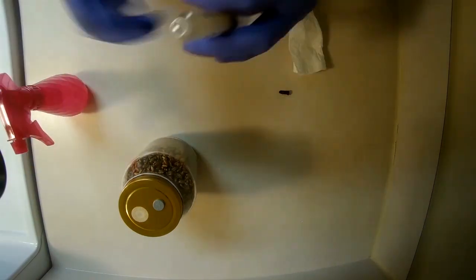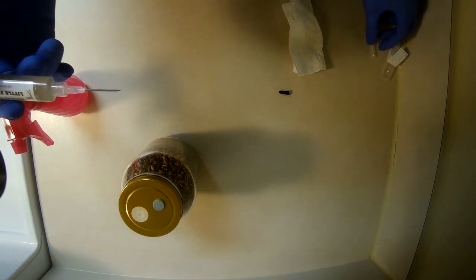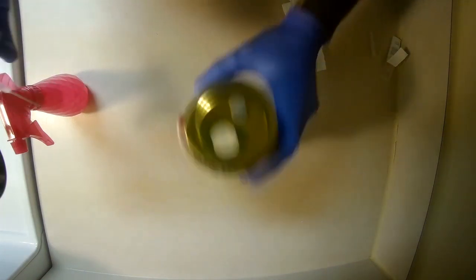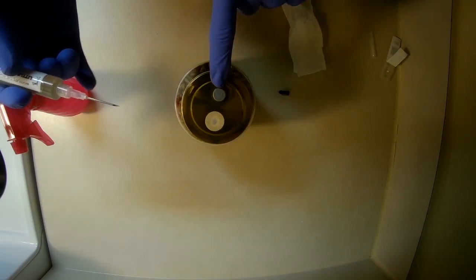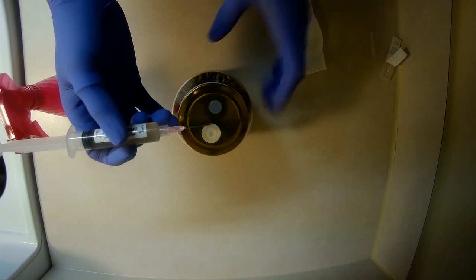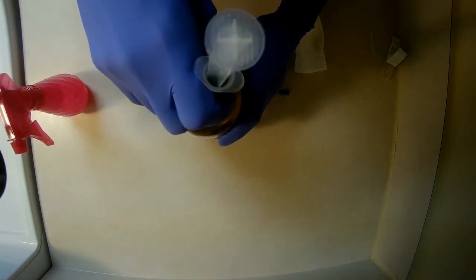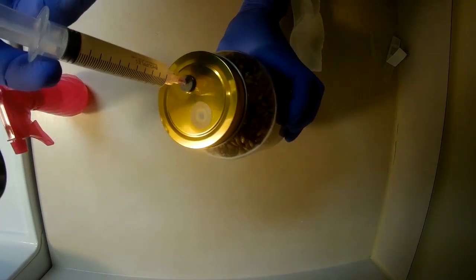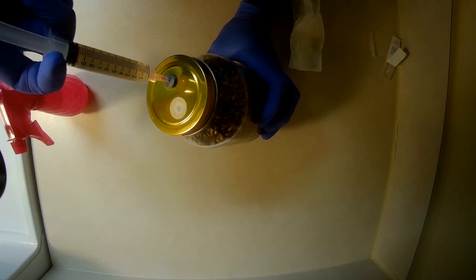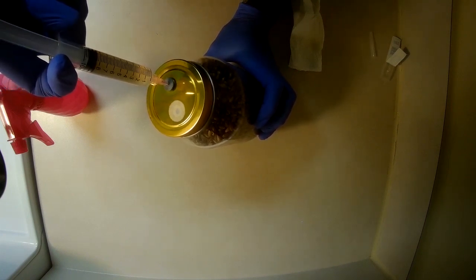The needle we don't need to worry about sanitizing because it comes pre-sterile in the package. You're going to want to take off the cap and then get the inoculation jar. You're going to find the self-healing inoculation port and stick your needle right through there. Once you've got the needle all the way through, you can then add in your inoculant. For this, I chose to use about 2cc's of a liquid culture.